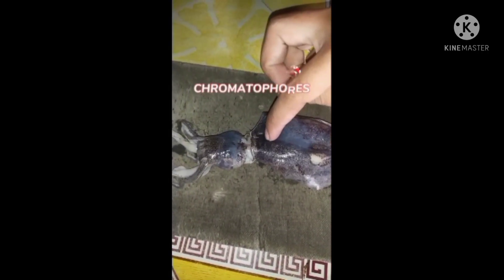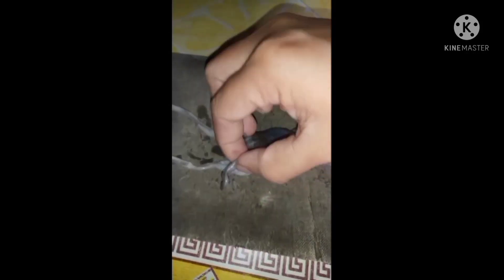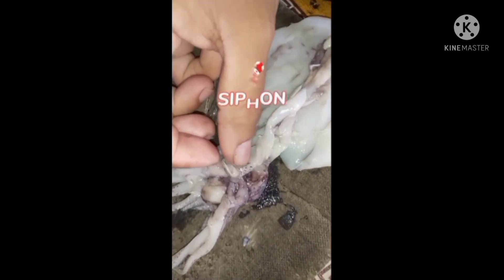mantle, chromatophores, eye, arm, suction cups, and the tentacles.